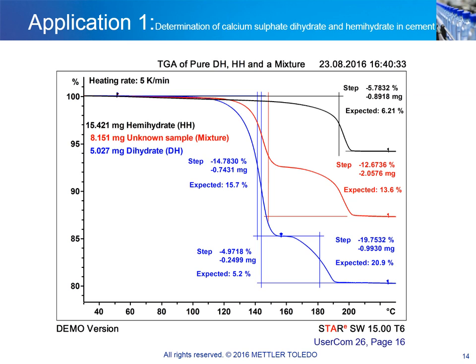The pure hemihydrate, shown in black, only has 1/2 water of crystallization, the loss of which matches the second mass loss step of the dihydrate seen above 150 degrees Celsius. By comparing the temperatures and the ratios of the mass losses of pure hemi and dihydrate samples, these quantities can now be determined in unknown gypsum samples. A measured curve of an unknown gypsum sample is shown in red. It is clear from the curve that this sample is a combination of hemi and dihydrate.